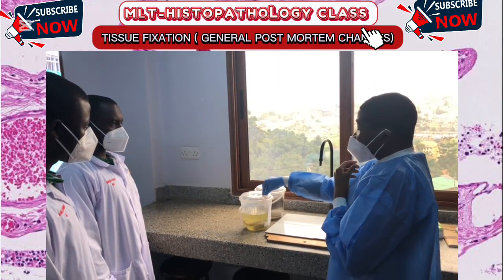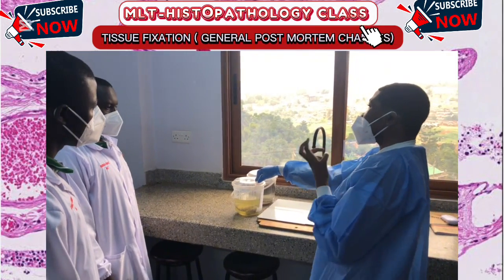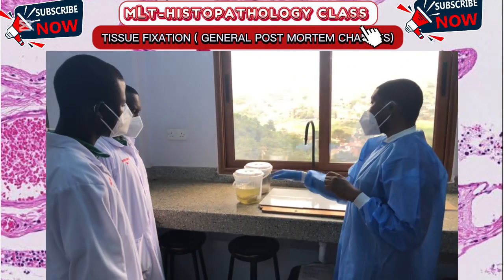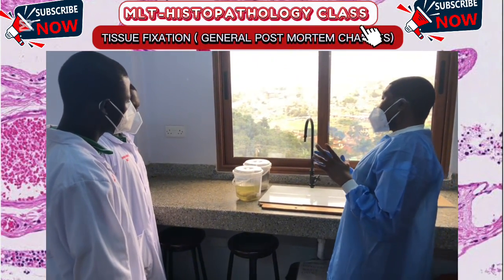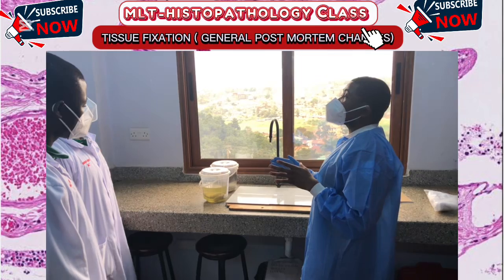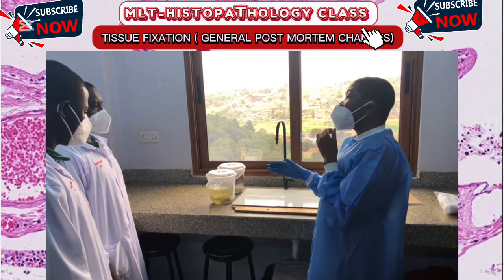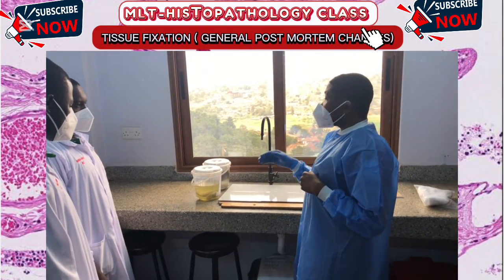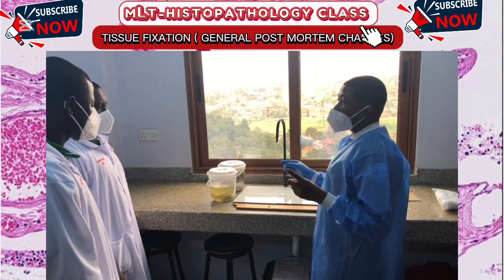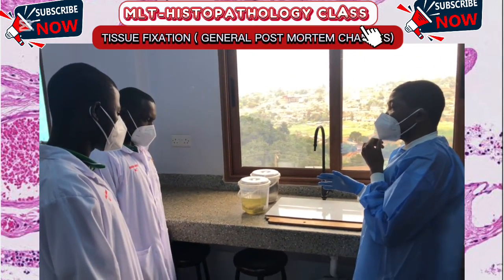So in other words, the fixative is a substance which preserves the shape, structure, relationship, and chemical constituents of tissue or cell after death. So upon blood interruption, in other words, these cells or tissues are cut off from blood, or there is no blood supply to these tissues. So since there is no blood supply, there is no oxygen anymore, and also no nutrients. Tissues are no longer receiving nutrients.